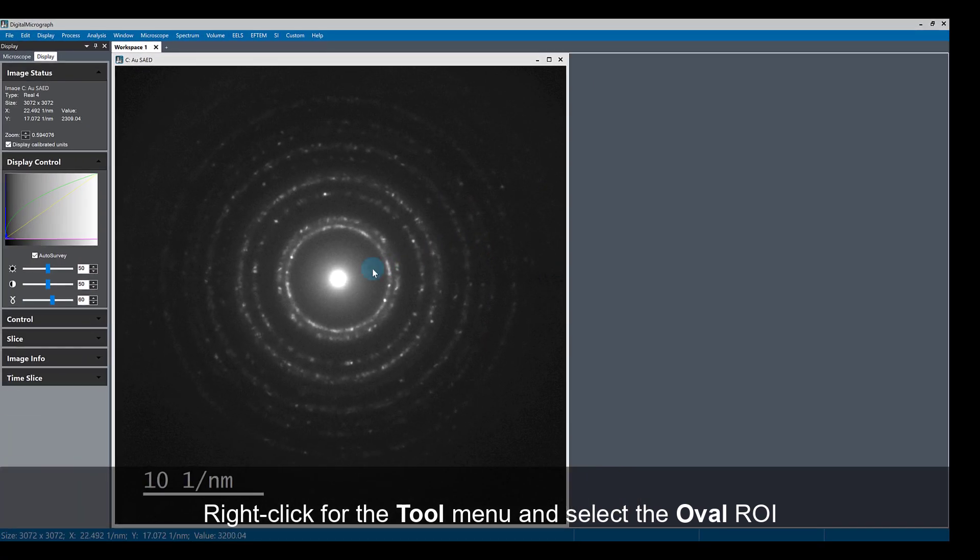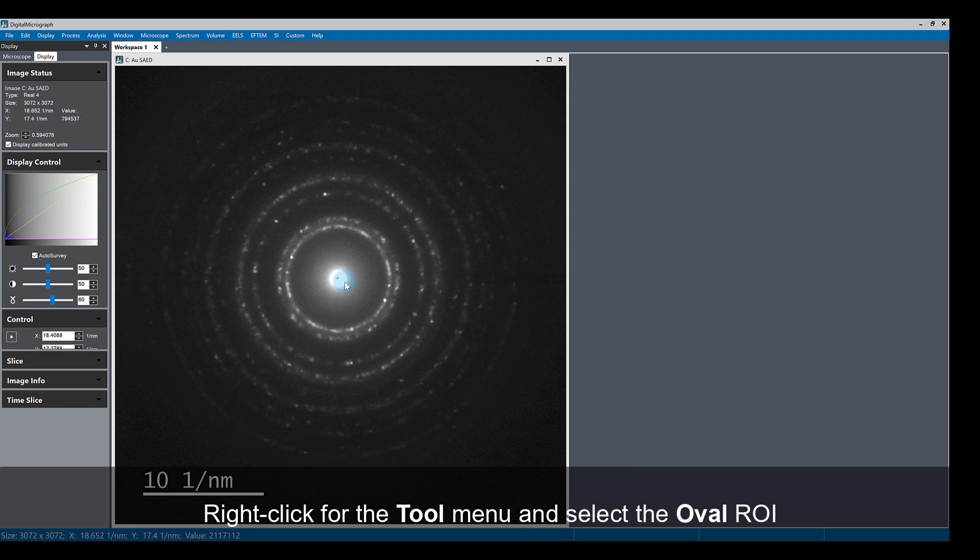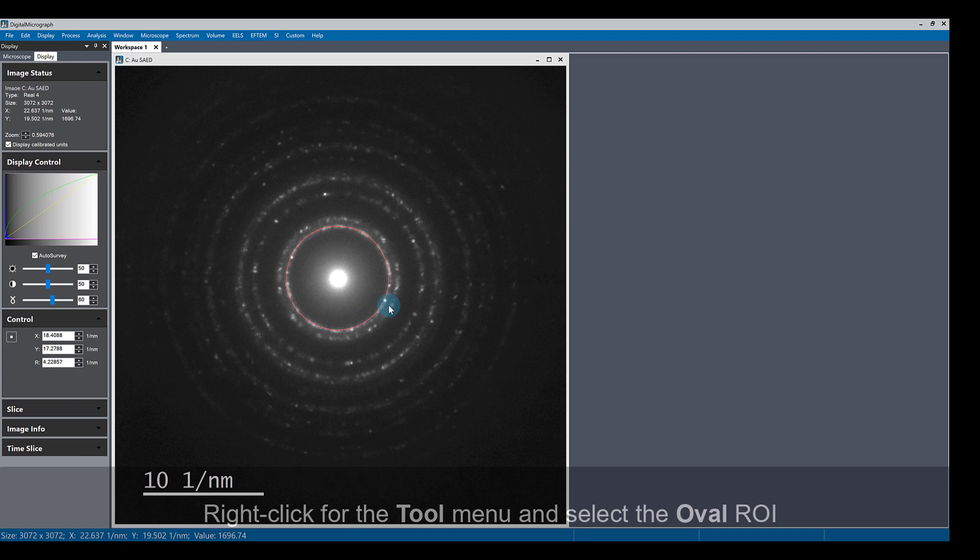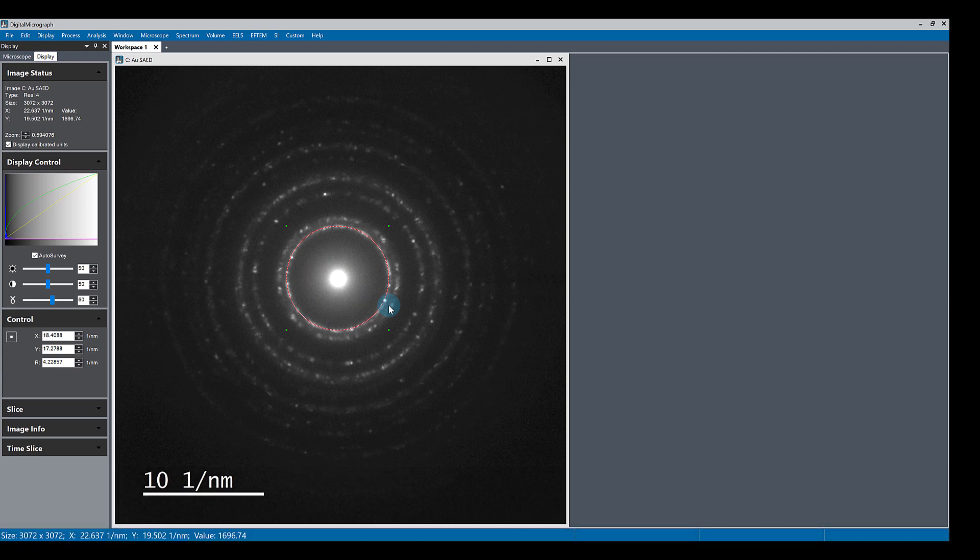This time, if you hold shift, it constrains the oval tool to a circle so you can draw a perfect circle ROI on your image to outline the area that you want.